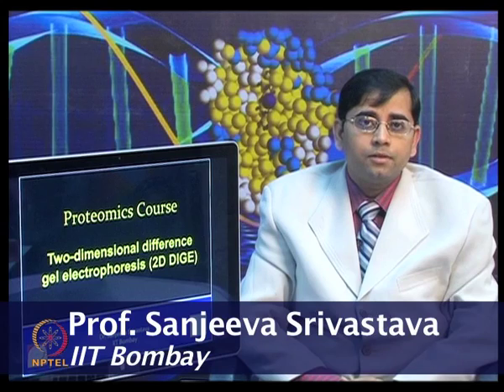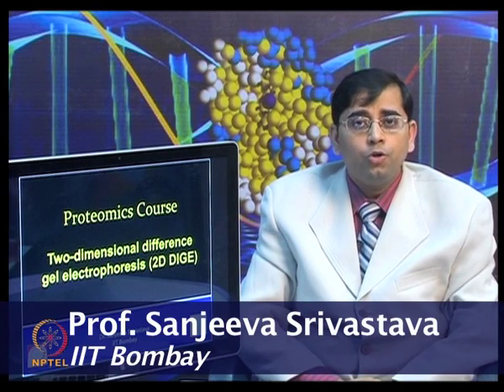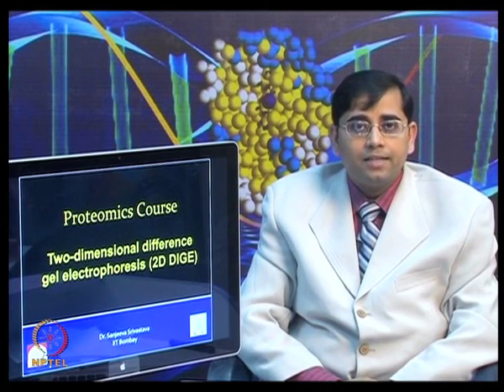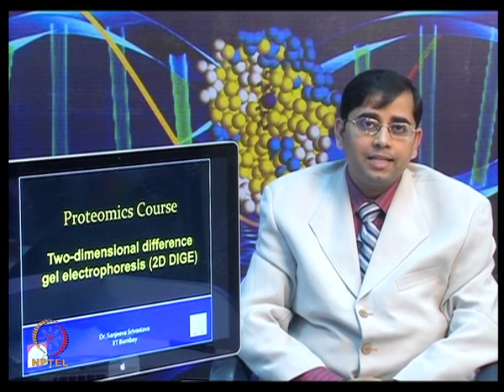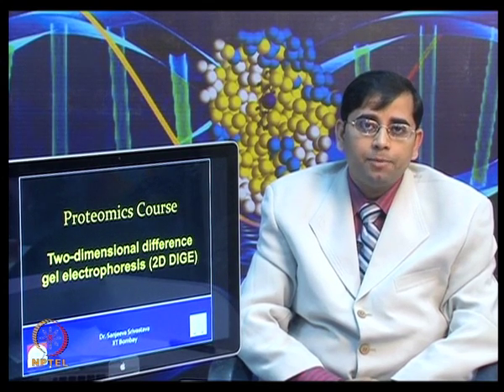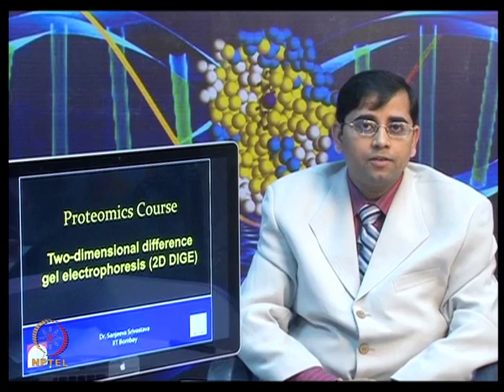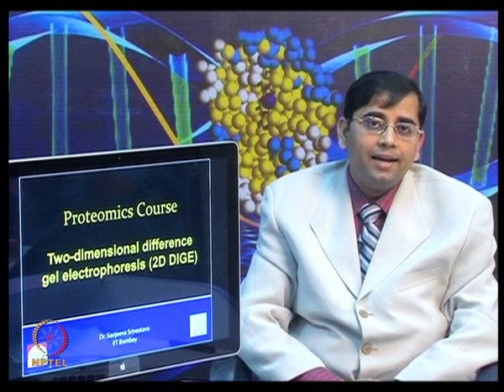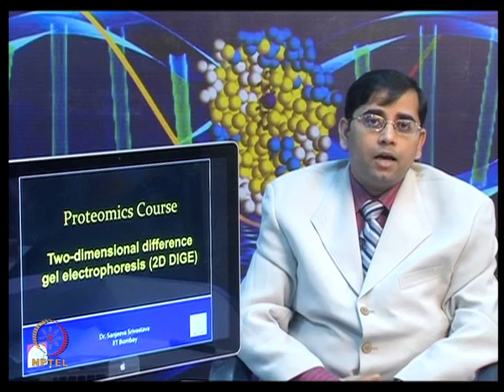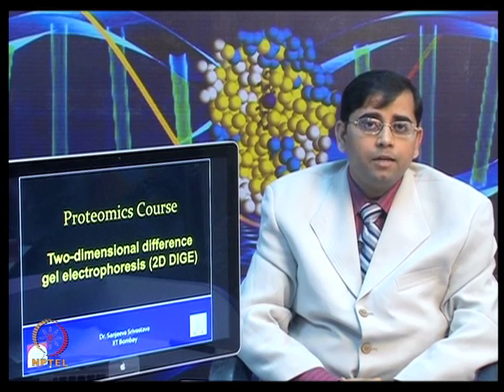In previous lectures, we talked about the two-dimensional electrophoresis workflow, how to perform two-dimensional electrophoresis step by step. We discussed protein extraction, isoelectric focusing, equilibration, and second dimension separation using SDS-PAGE. Finally, we talked about different types of staining methods which are available and how to scan and analyze those images. We then further talked about different advanced methods which are creative ways of overcoming limitations of gel based approaches.